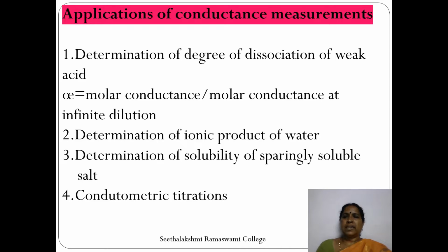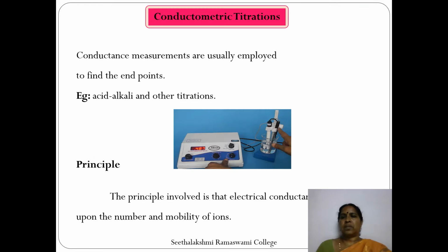Applications of conductance measurements. There are many applications of conductance measurements. To mention a few: determination of degree of dissociation of weak acid, determination of ionic product of water, determination of solubility of sparingly soluble salt, conductometric titrations.